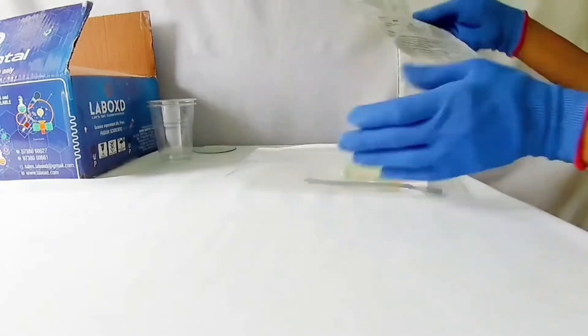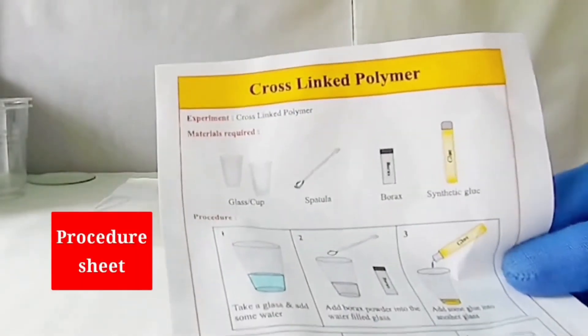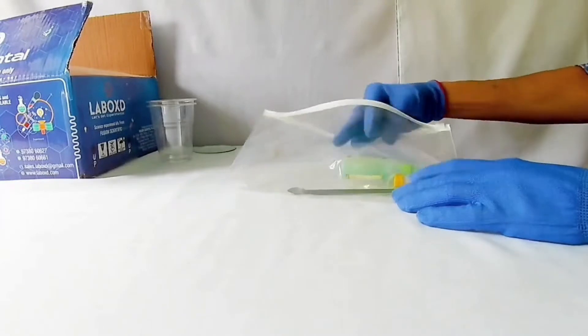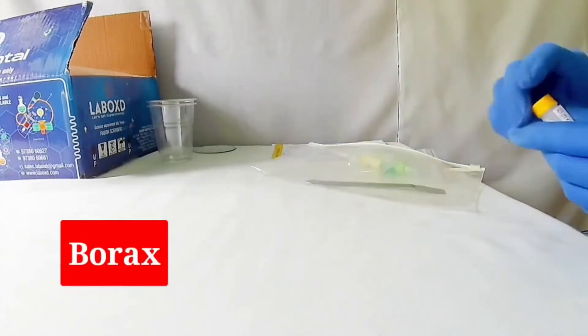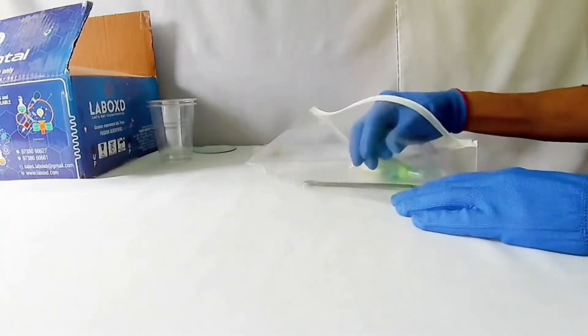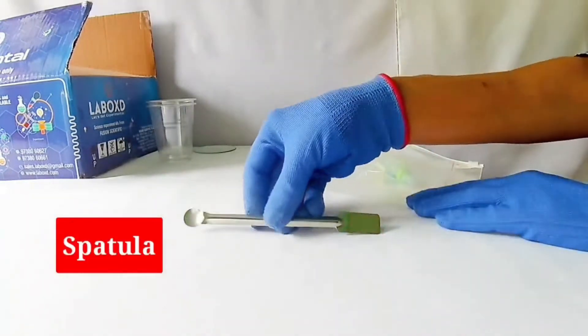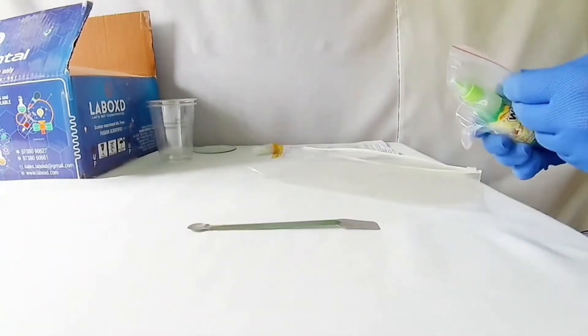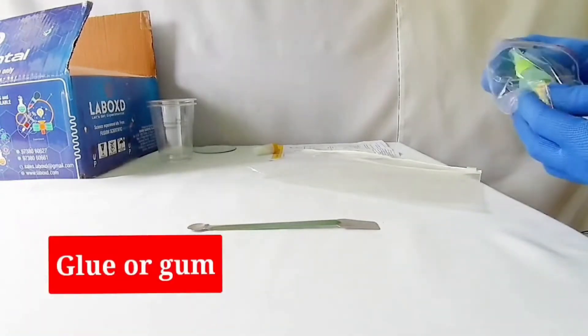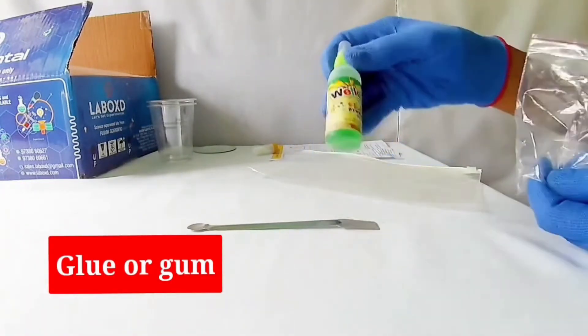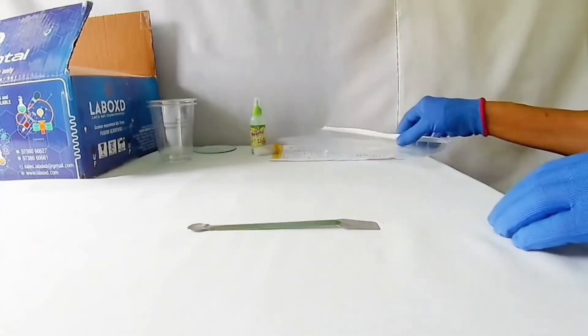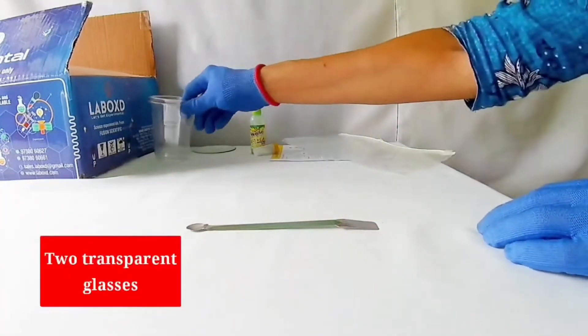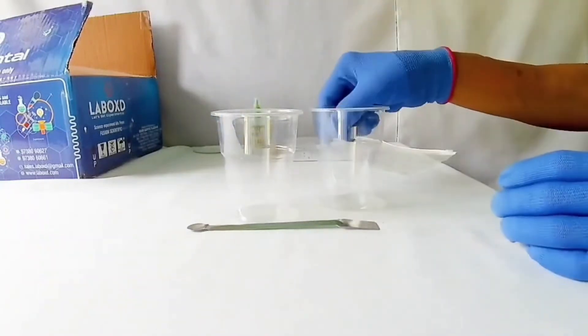In the Activity Packet, we have Procedure Sheet, Borax Powder, Spatula, Glue, and Water. Also, we have two transparent glasses and a watch glass.